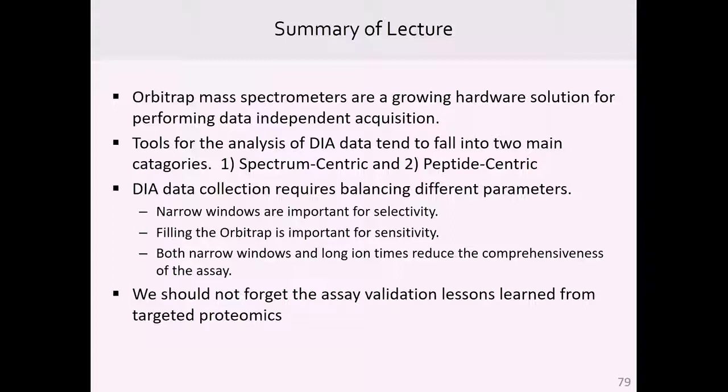In fact, it fits really nicely into what we used to always call in our SRM assay belt of refinement. So we have this refinement step of which peptides are stable, which ones are precise, which ones have good retention time characteristics. And so what Brendan's bringing up is basically we're using the same analogous strategy in our DIA data. I'll tell you some very simple ways in which we do this on Thursday, which I'm pretty excited about because they make the workflows a little bit easier.